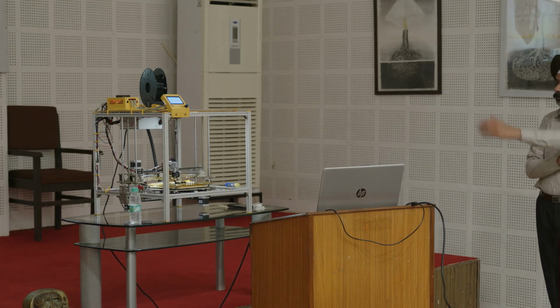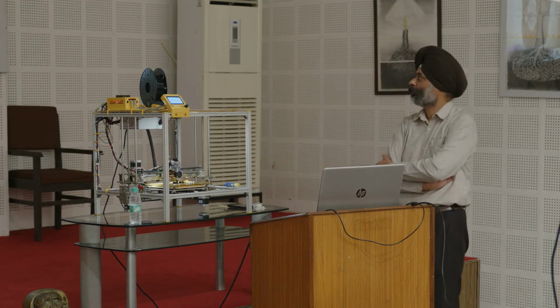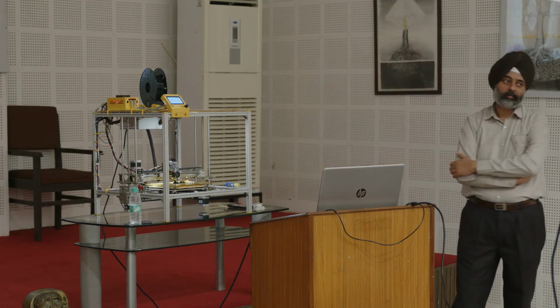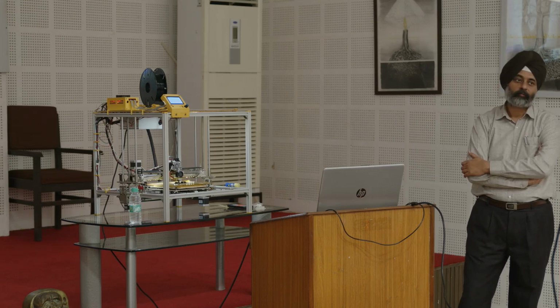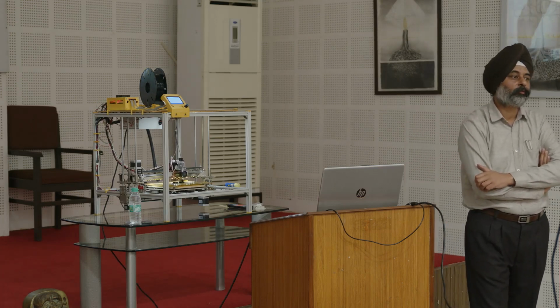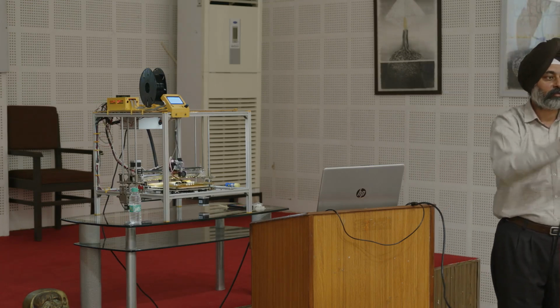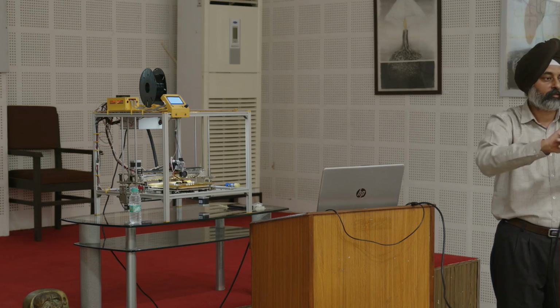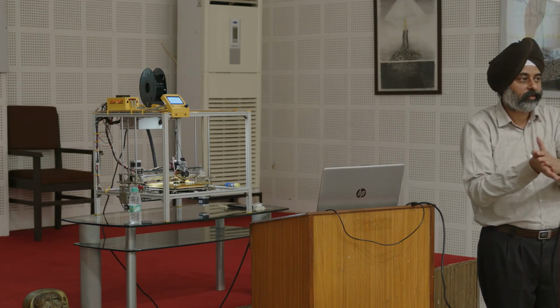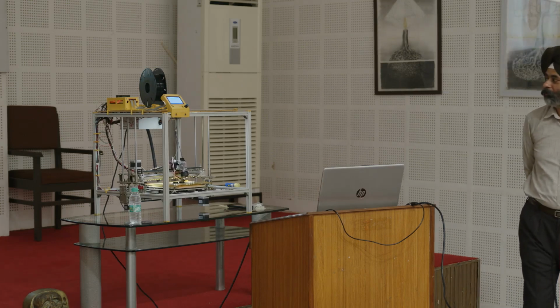this is the one. As you can see, this is a stepper motor here. A similar one. It can give you a step size of 1.8 degrees. So these are all working usually in the open loop system. So you just pass on a certain number of pulses to the motor, and then it executes that many steps, and so that much angle it turns. So with that you can have a precise control over the movement, a digital control.